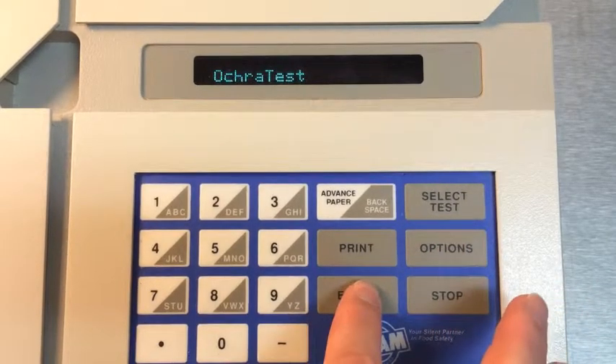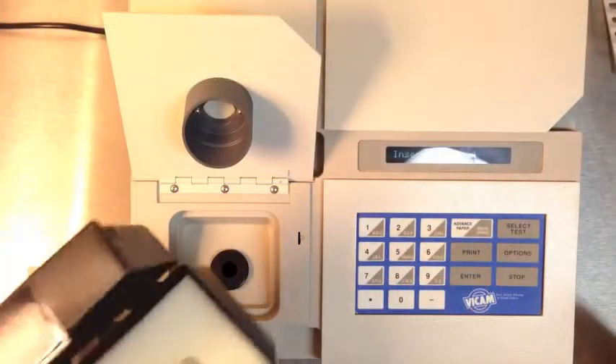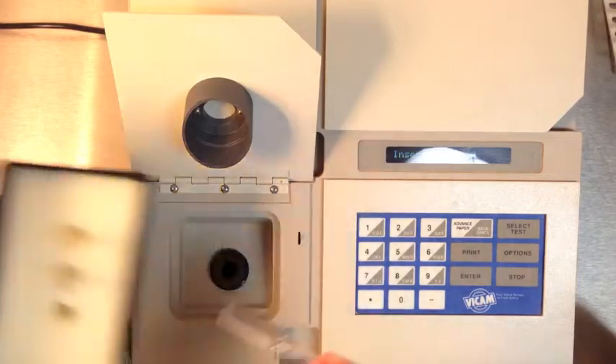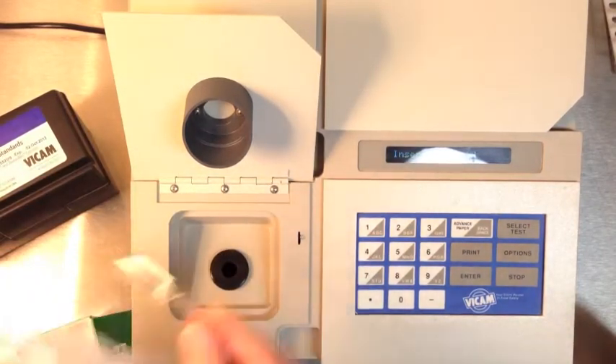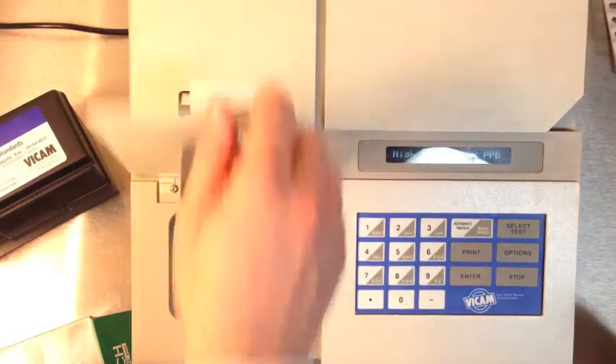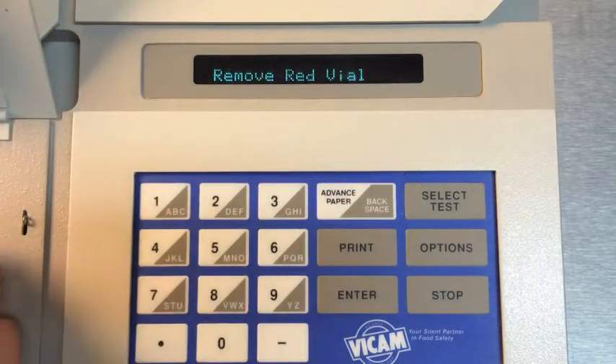Press Options. Press Enter to select Calibrate Test. Press Select Test to choose Ochre Test. Open the lid and insert the red vial when prompted. Adjust the red calibration setting to the level noted in the current procedures manual. Press Enter to select.